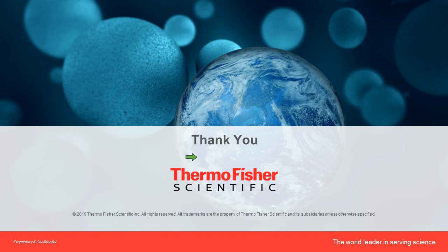Okay, great. Thanks, David and John. So the first question, it looks like, is for David. The first question is, are the MVP particles prepared using a baculovirus system? And if so, how do you ensure the absence of infectious baculovirus from your MVP preparation?